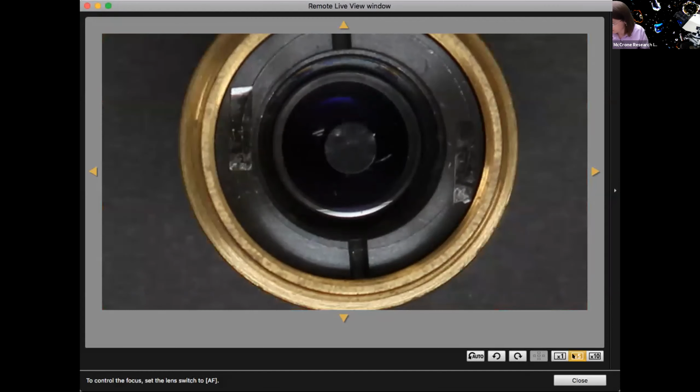If you had done it with one of the correction fluid ones, you'd have to try and reposition the whole cover slip. So that's why I recommend this technique instead. Okay. So I've made one of these. What I wanted to do is install it on my microscope, and you guys can have a look, and we'll see what the dispersion staining images look like.